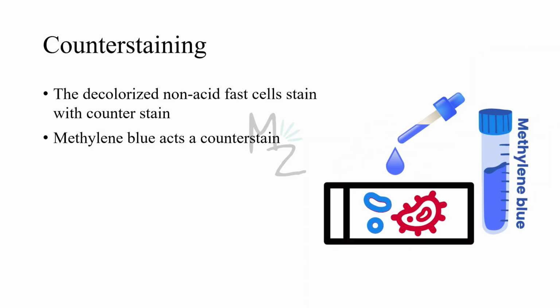Last step, the counter staining. We'll add the methylene blue that acts as a counter stain. The decolorized non-acid fast bacteria will stain blue with the counter stain, as you can see in this picture.